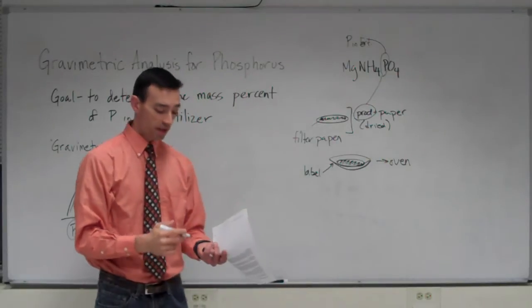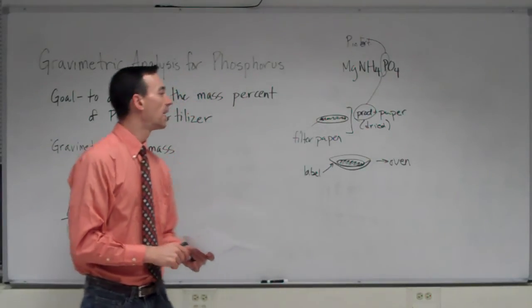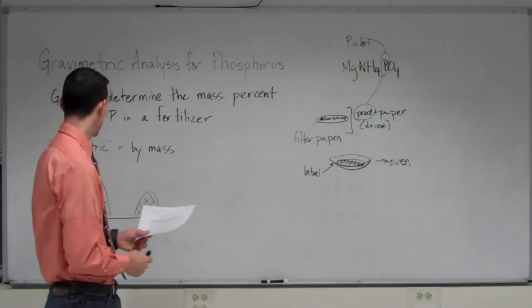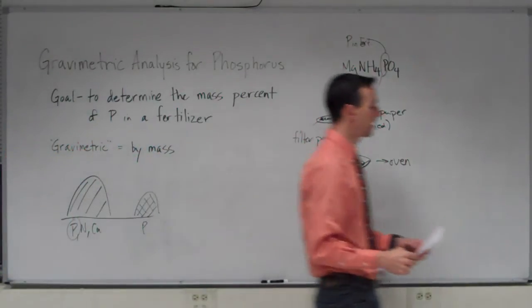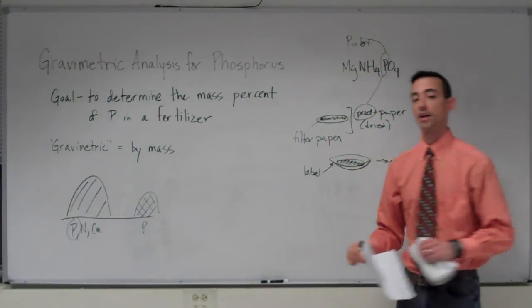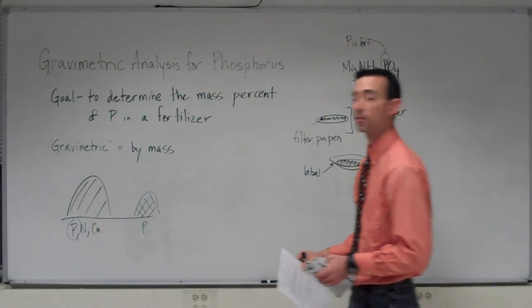So the procedure itself is fairly straightforward, and I'd rather focus on the calculations involved in the pre-lab because they are very closely related to the calculations that you'll do as part of the lab report.